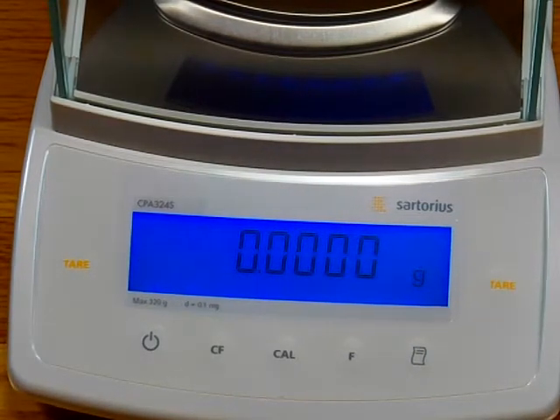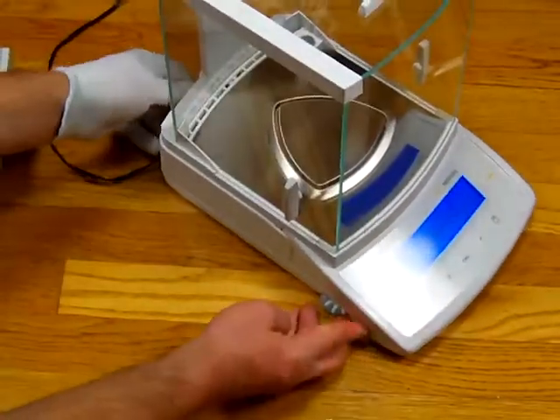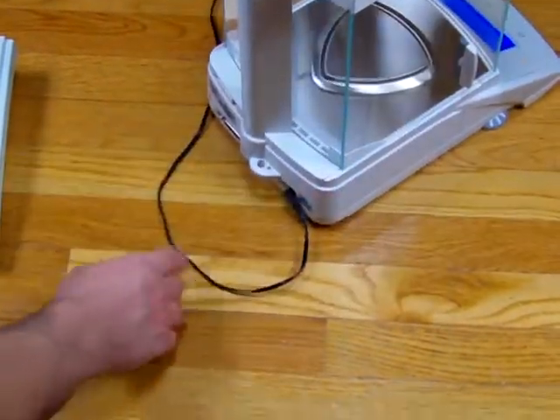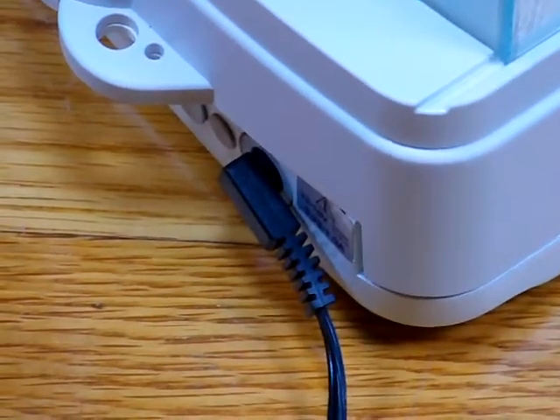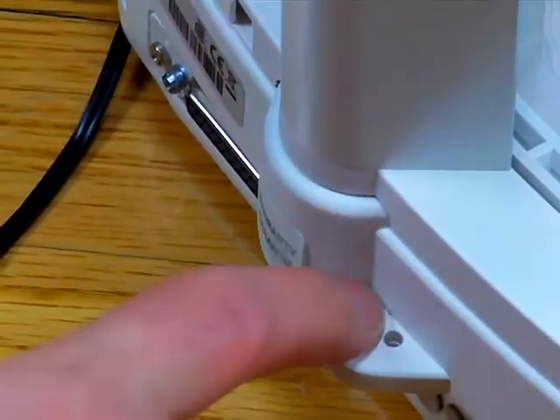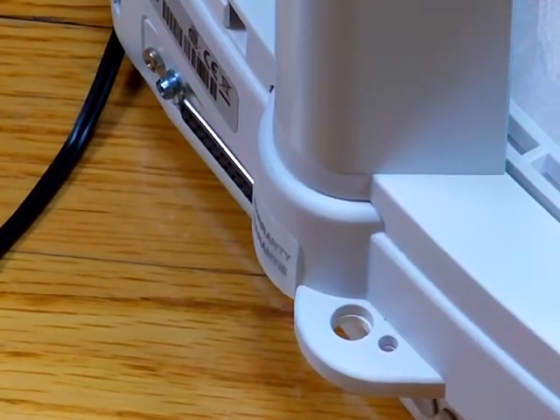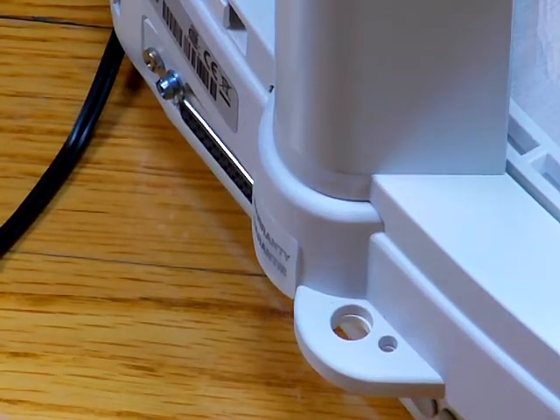The balance also features an RS-232 interface on the rear. We're going to plug in a printer. You can see there's an AC adapter — this is how the balance is powered. There's an RS-232 interface, and there is also a hole in the casting so that one can route a cable through. If this is a university and you want to lock this down in the lab, Sartorius sells a locking cable option so you can securely keep your balance in your lab.